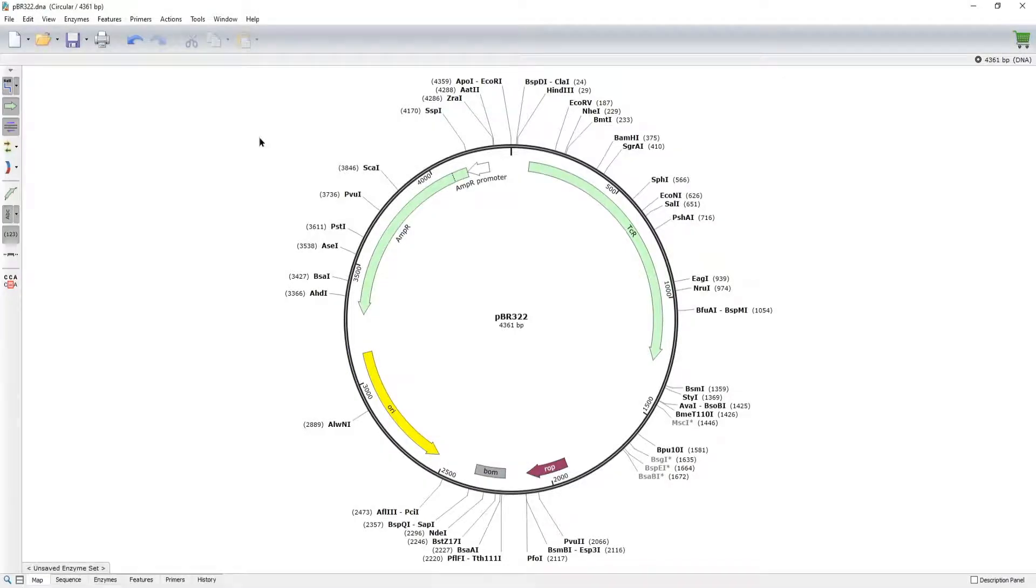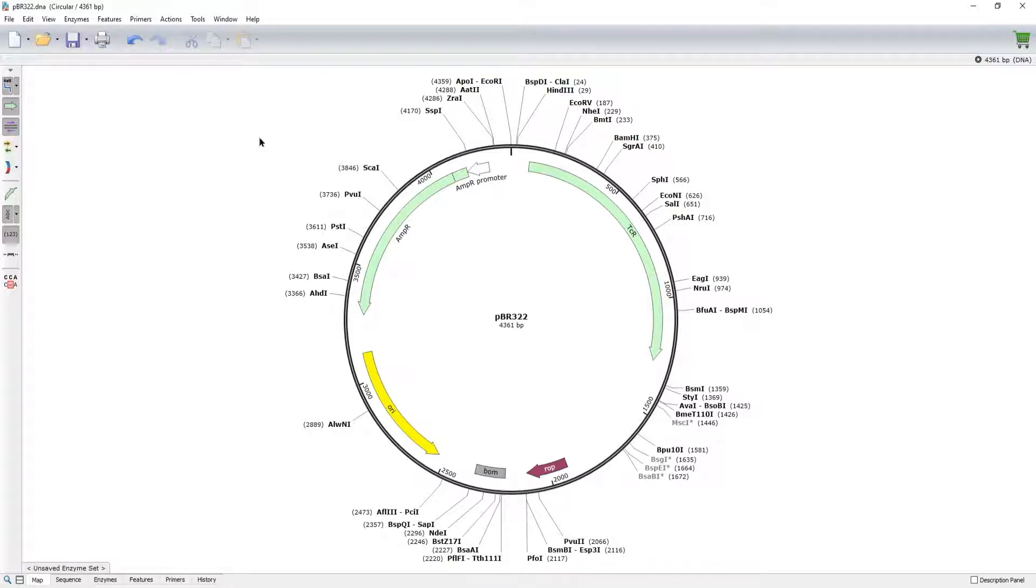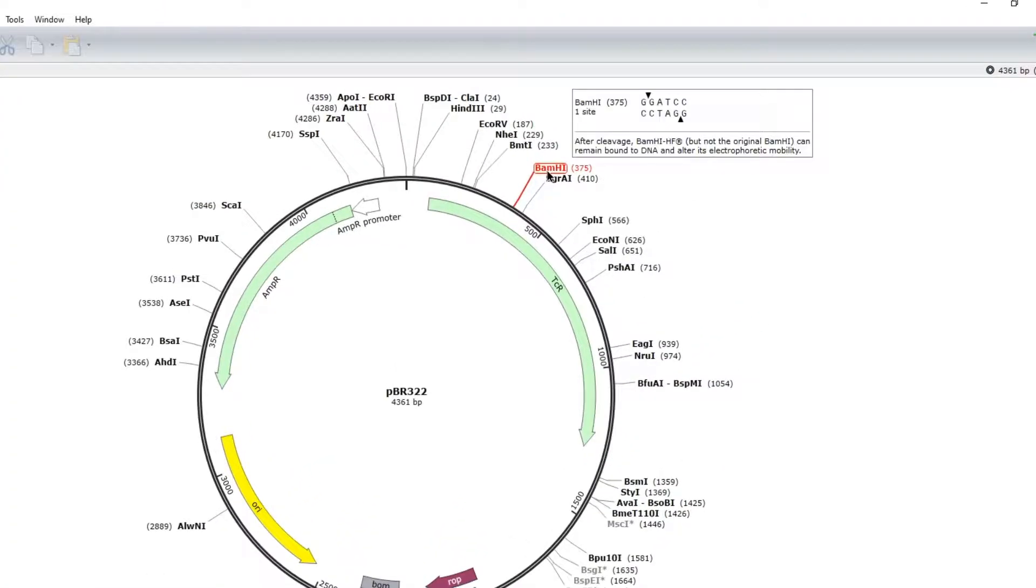By default, SnapGene displays enzymes that appear once in your sequence and have a six or more base pair recognition site. Restriction enzymes that only cut once are marked in bold, and the hover option allows you to access more detail easily.